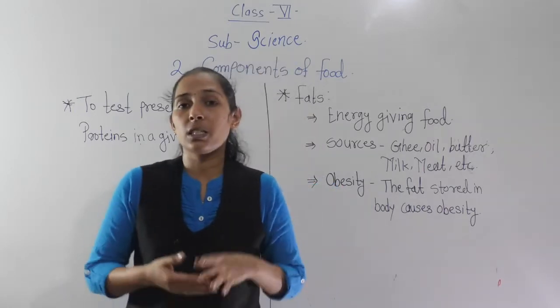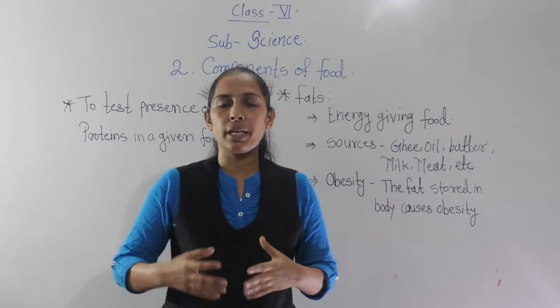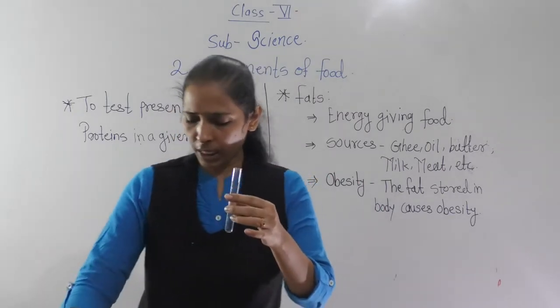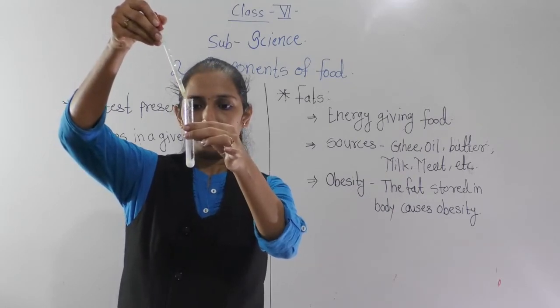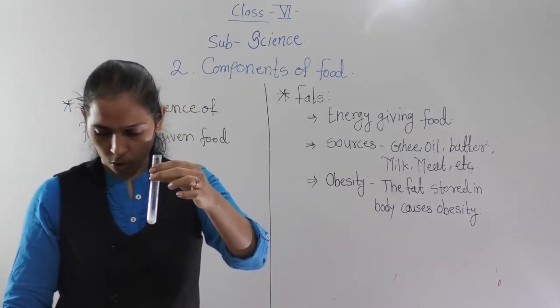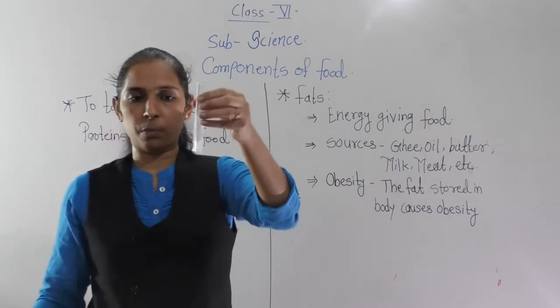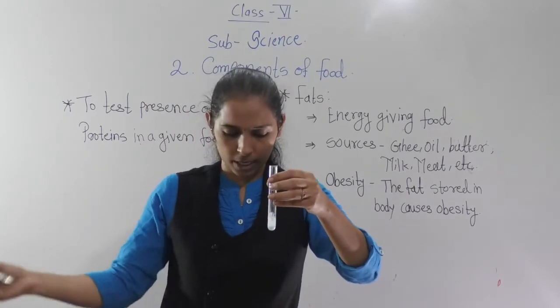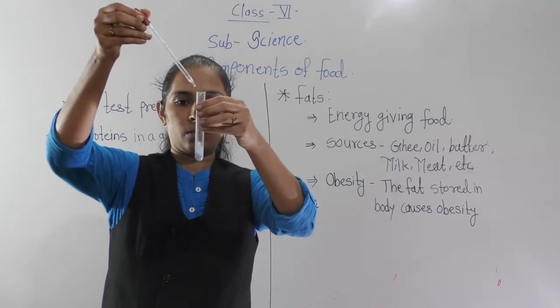So let's do the activity. The aim of our activity is to test the presence of protein in a given food sample. I will take one test tube and add some drops of milk into it. I have added some amount of milk. Now I will add two to three drops of copper sulphate solution, then mix it properly by shaking the test tube. Now I will add nine to ten drops of caustic soda, that is sodium hydroxide.